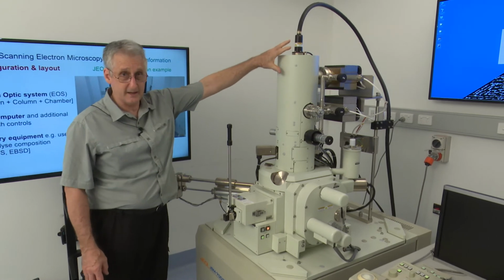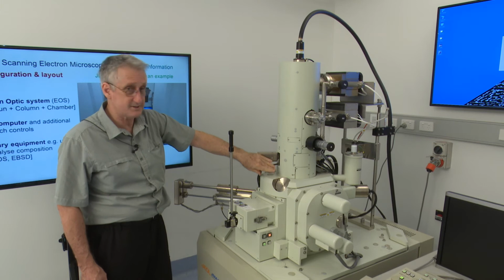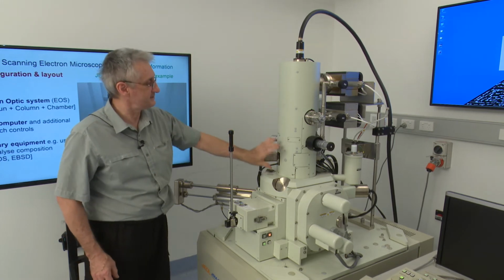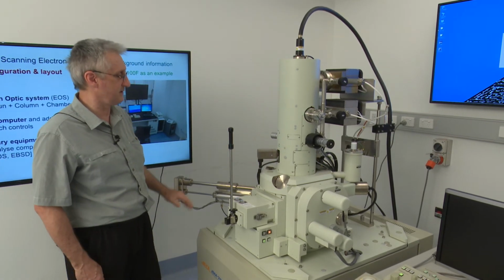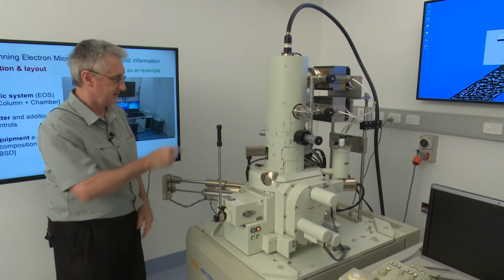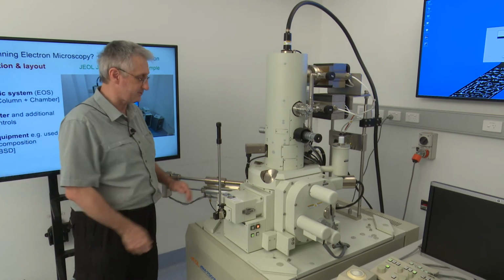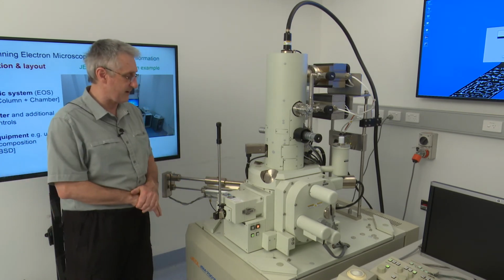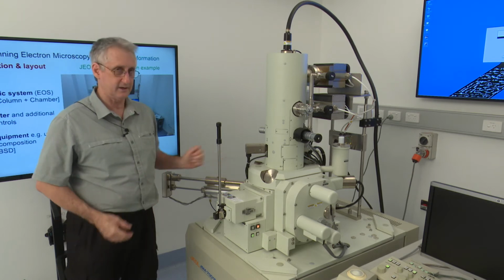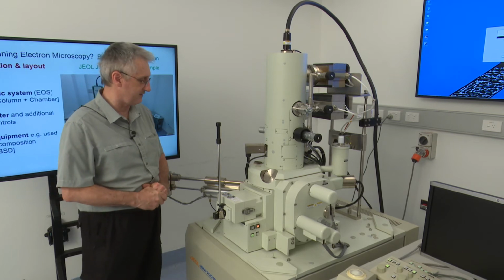But what we might do now is have a bit of a look at the 7001 electron optic system, comprising the gun, which is inside the chamber here, fed by a high tension lead. The column runs down here. There are magnetic lenses positioned down here to control and shape the beam. Down here is the chamber. That is where our specimen is loaded into. We have a sample loading rod here, which we can insert samples in, a pre-chamber that we can use to pump down before we expose the chamber to a reduced vacuum or a poorer quality vacuum.